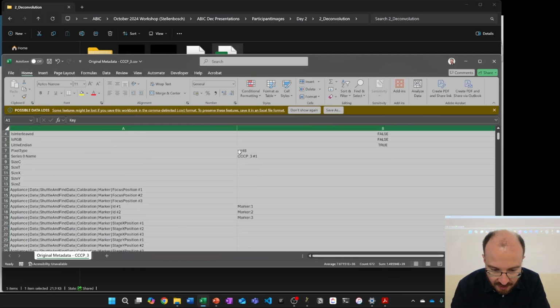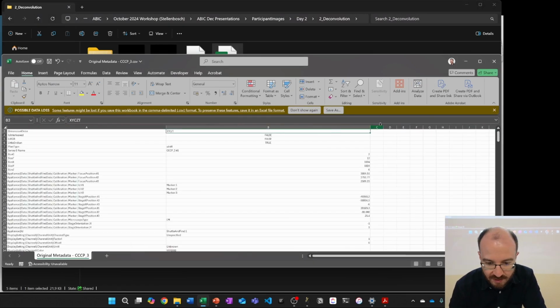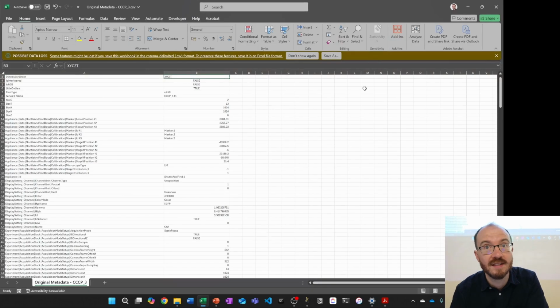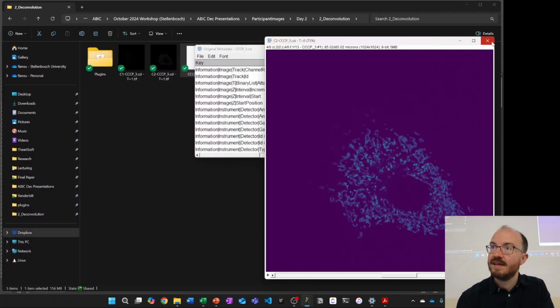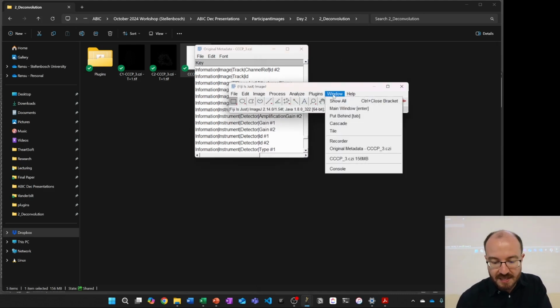All right, so just let me know if you have gotten to this point where you actually have the metadata available. You can look at it in Excel pretty easily. Mine opens 50 files. Something's going on. Do you have to split the time? Well, if you want the metadata, you don't need to.